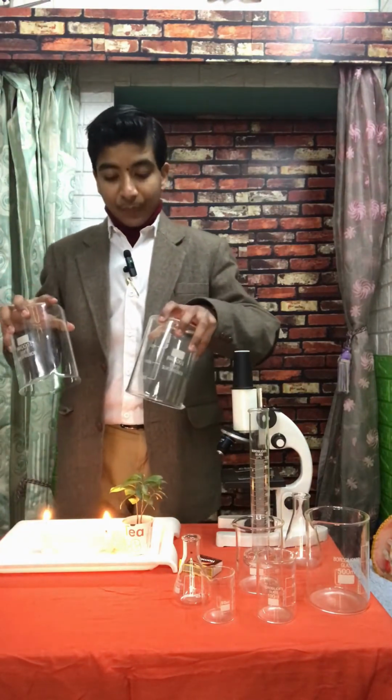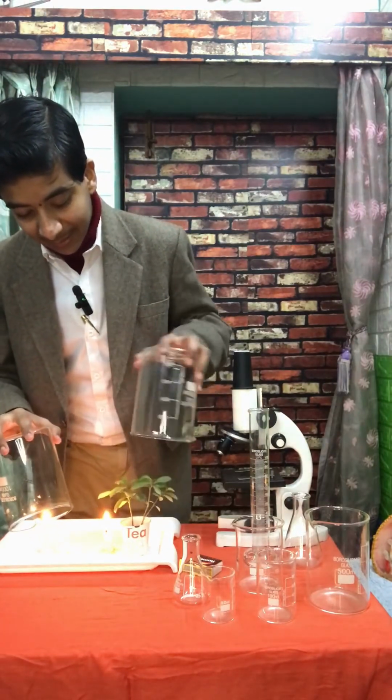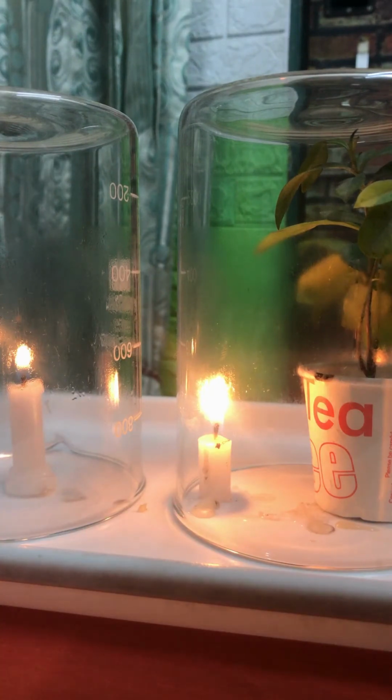Okay, so on a count of three, I'm giving you a chance again. On a count of three, two, one, place the beakers over here, right? Place carefully. Three, two, one. Fine. So let's just see what happens. Let's see which candle will go out first.